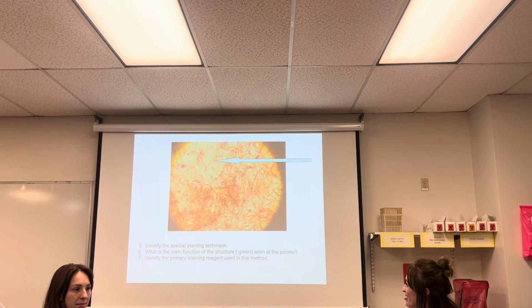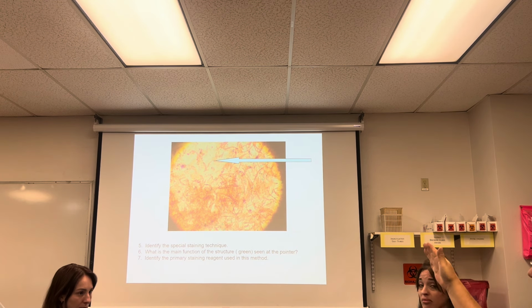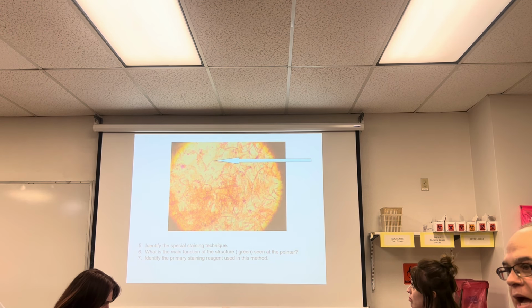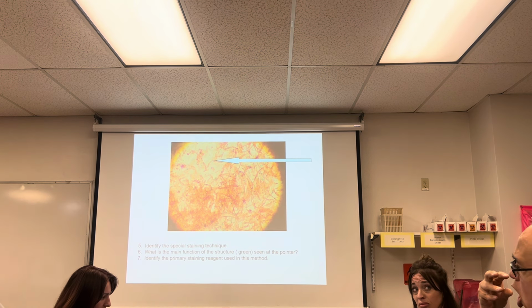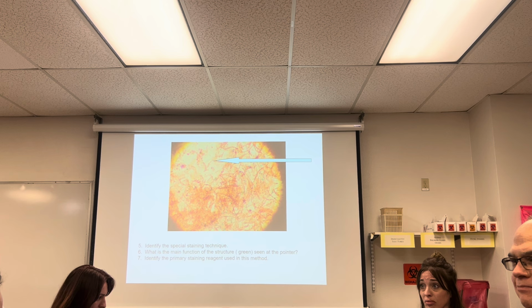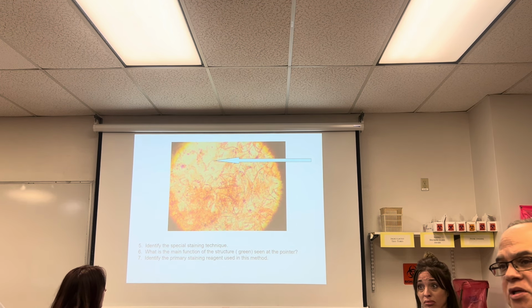Here we go. So, if you see purple and red, what? Gram stain. If you see green and red, endospore. And so that's the way I want you to think about it. I want your mind to focus on what you're looking at and come up with an idea of what you're looking at immediately. So you look at this, oh, that's an endospore, and now you're ready to answer the questions.